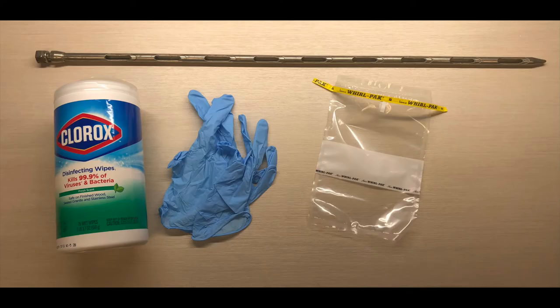The supplies you'll need for this portion of the video include a double-sleeved feed probe, disinfectant wipes, nitrile or latex disposable gloves, and a whirl pack or a plastic storage bag.